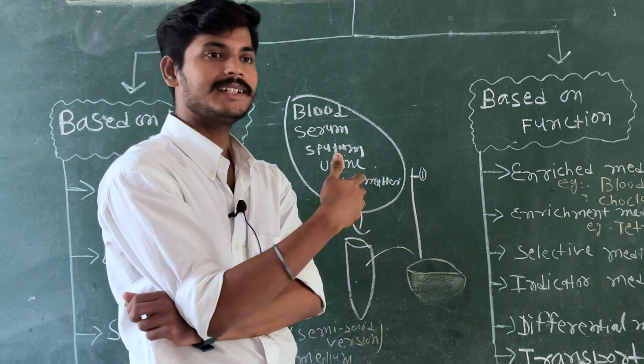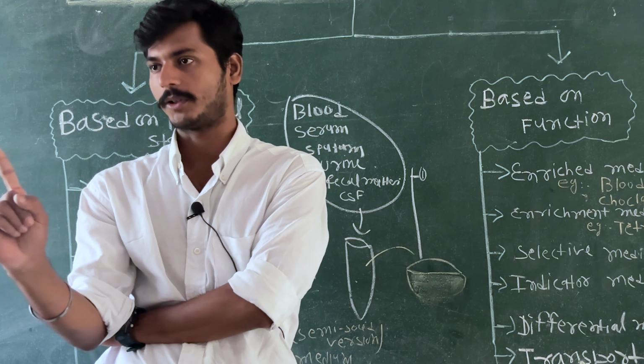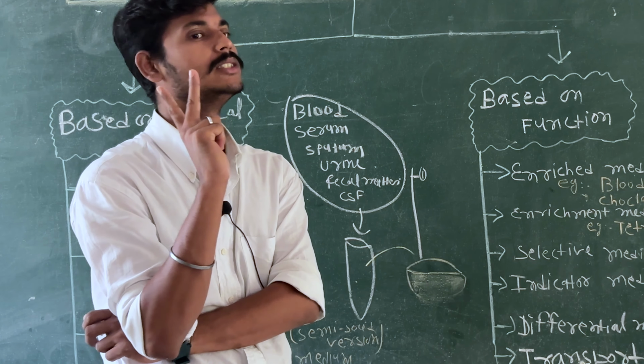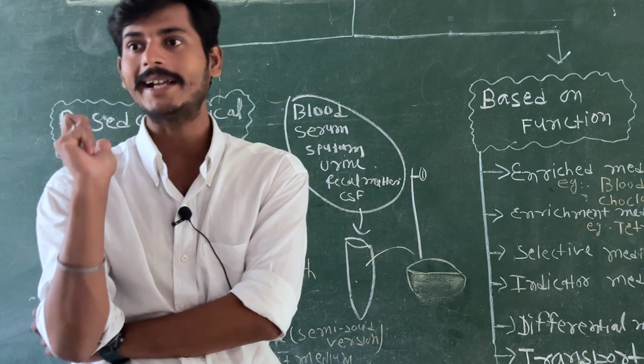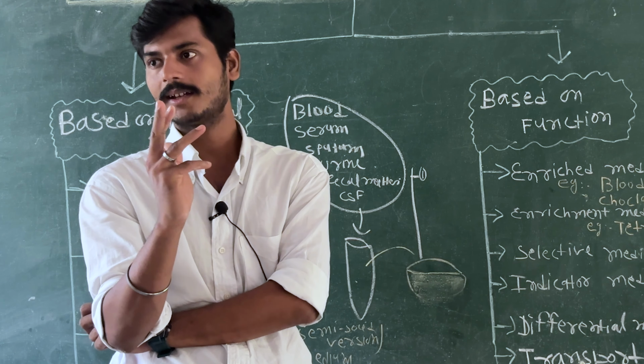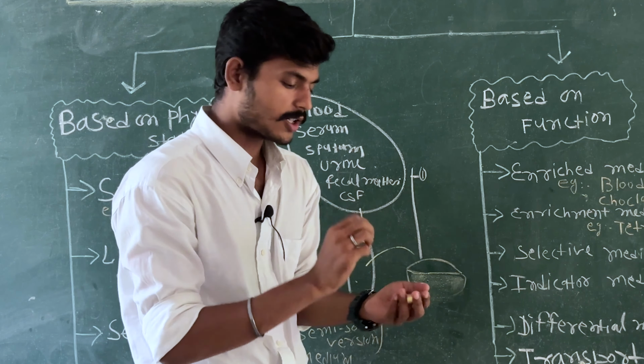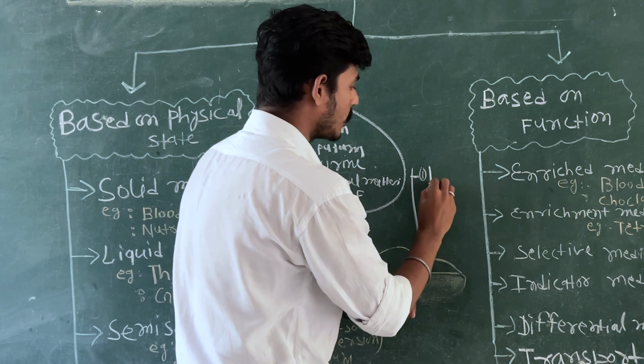What bacteria need is a source of protein first. Second thing they need is electrolyte. Third they need is water, and what is called a solidifying agent, agar. So first we will add the peptone.